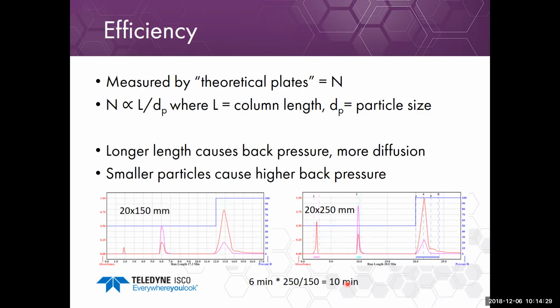I'm also going to ask you to kind of remember this compound for future use. 50% B, it comes out at 6 minutes. I'll show you why that's important when we come back to method development later.